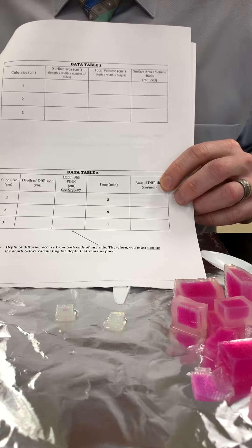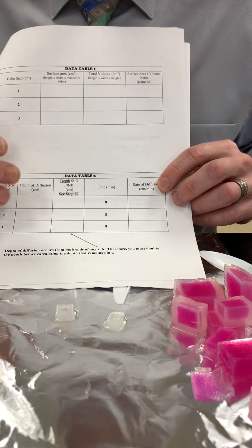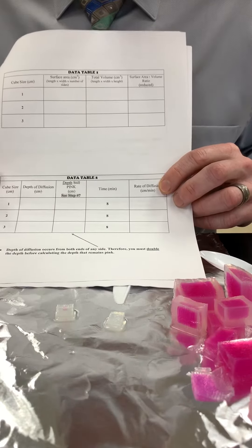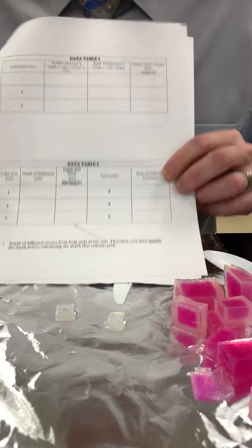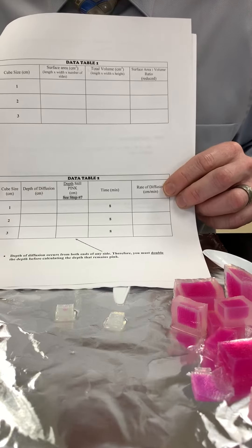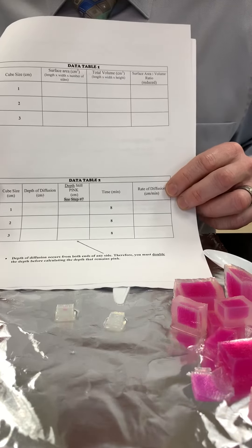There's a little bit more arithmetic that's more complicated, beyond the scope of this video, that we'll talk about in class. But this should be a helpful tutorial for those who may have missed the lab or just need a follow-up recap.